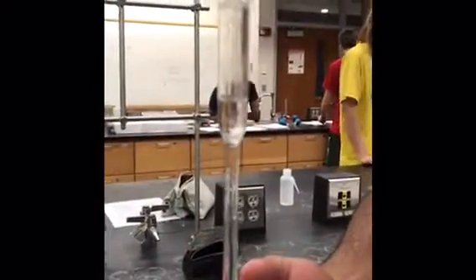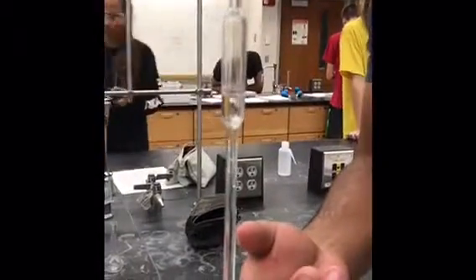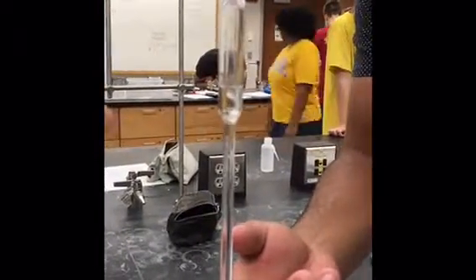So, meniscus comes from Greek meaning crescent or curve. If you look at a meniscus, you can see the curvature. A meniscus is caused by the upper surface of a liquid close to the surface of a container or another object, and this is caused by surface tension. So you see the crescent shape.